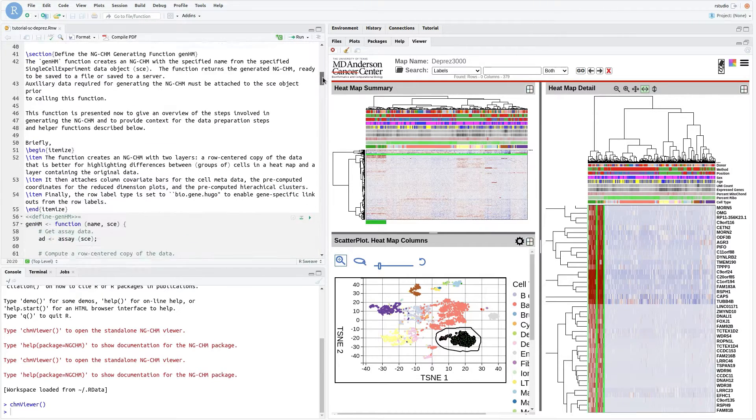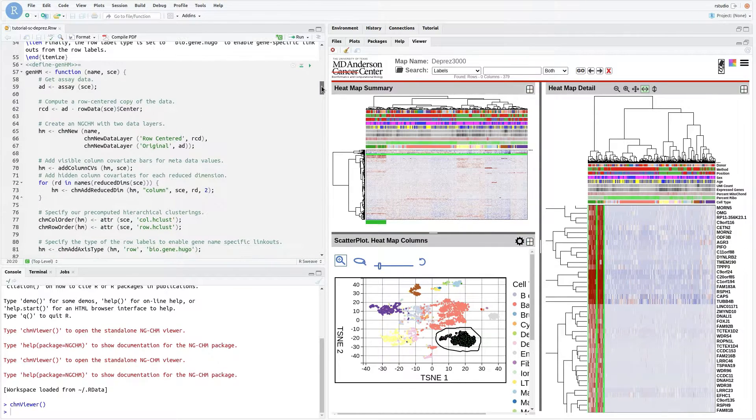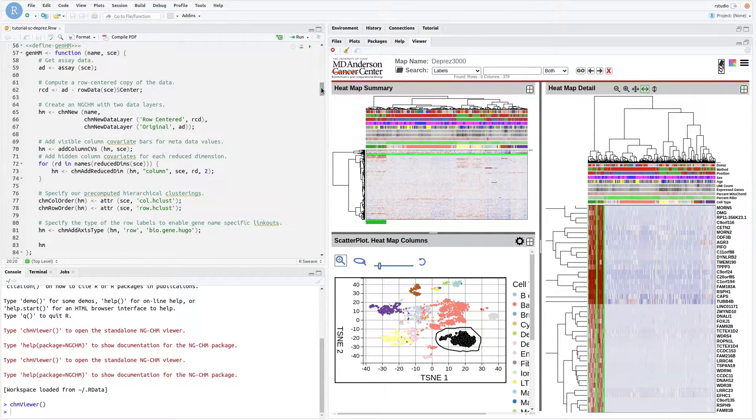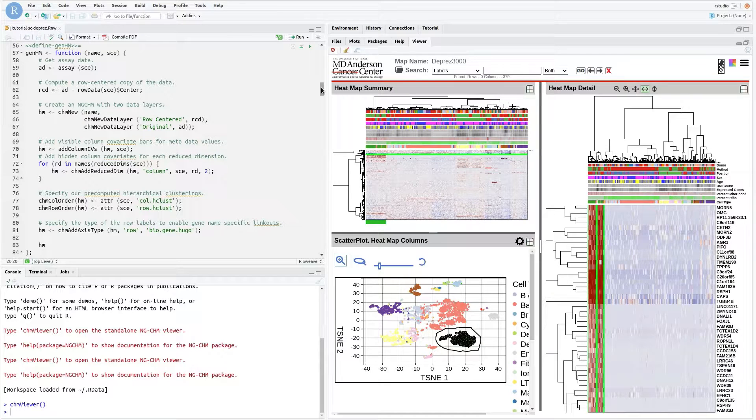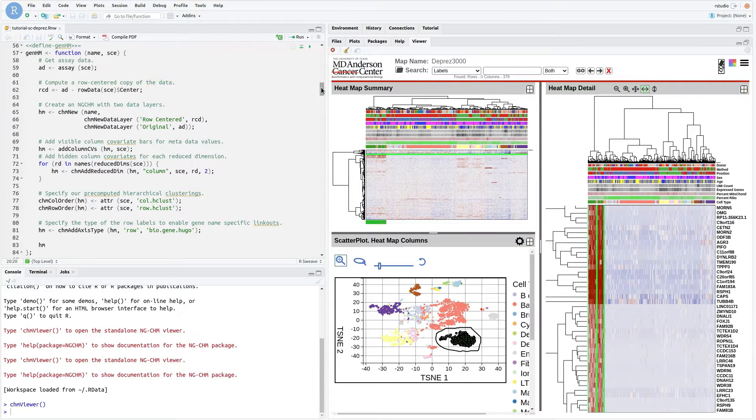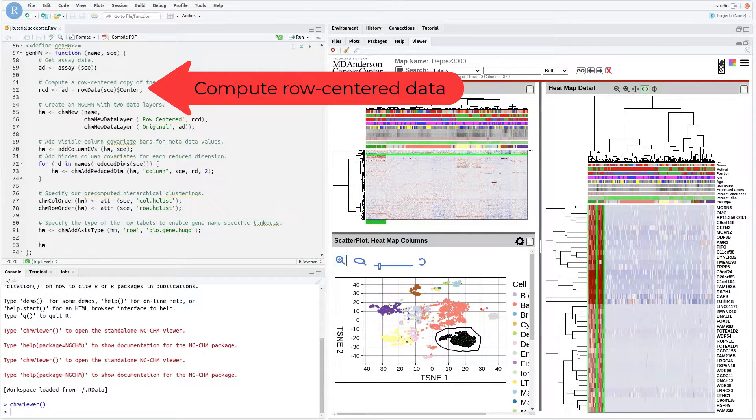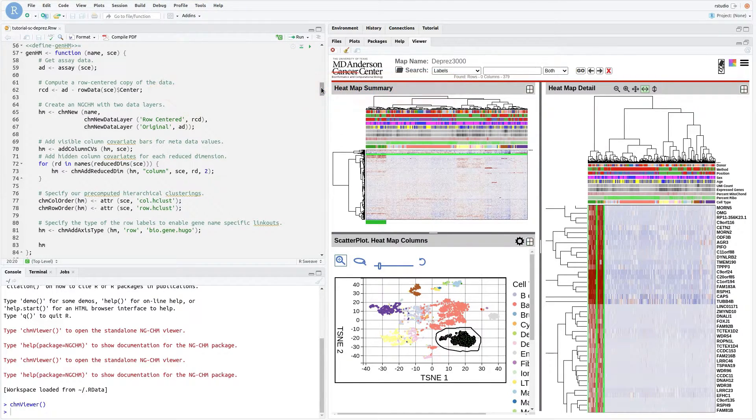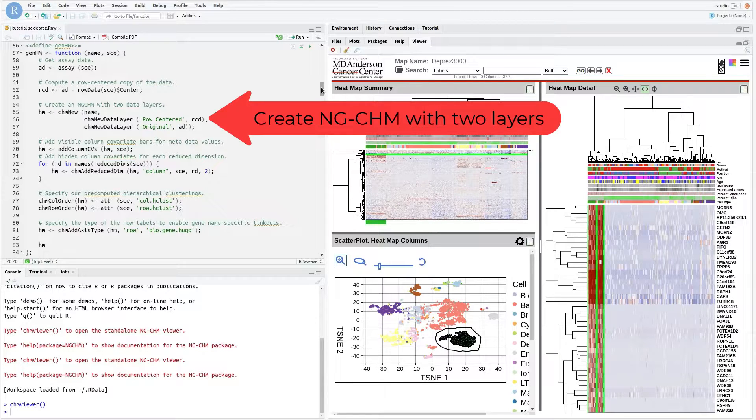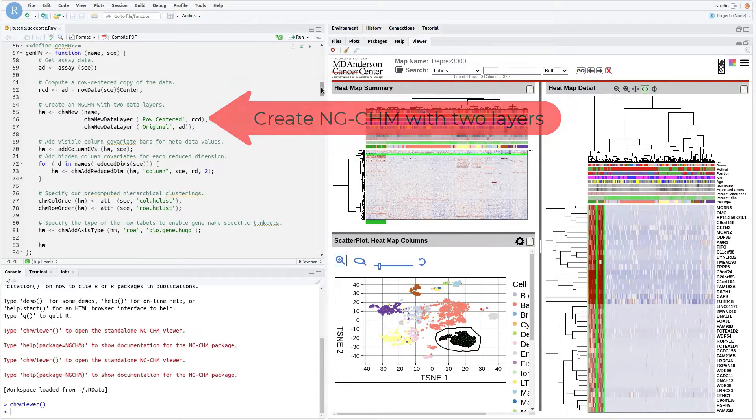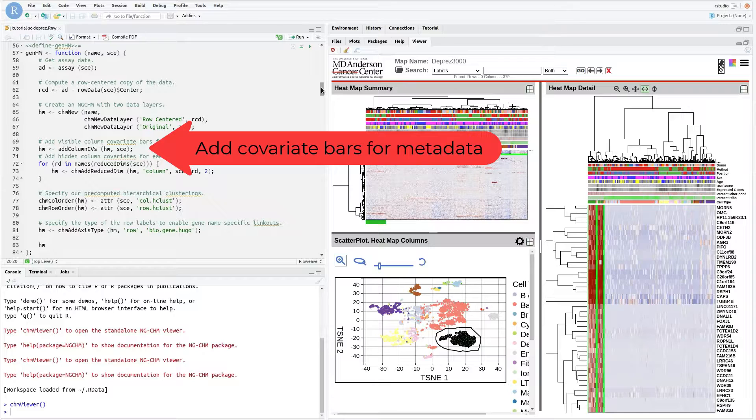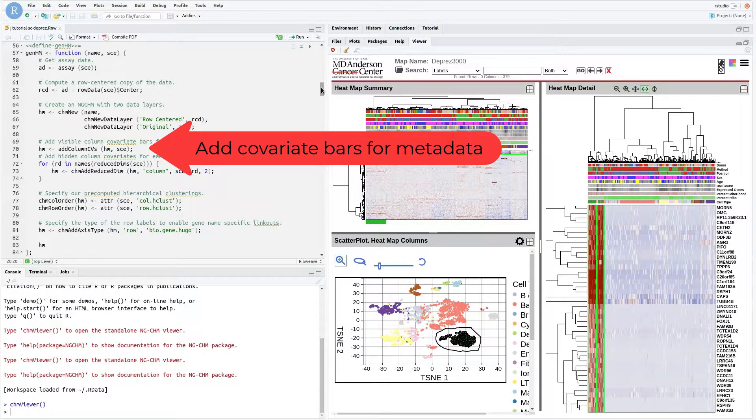We will start by reviewing the function GenHM, which generates an NGCHM from a prepared single-cell experiment object. The steps in the function are: get the desired assay data, compute a row-centered copy of the assay data, create an NGCHM with two data layers. Add the visible column covariate bars based on the metadata in the single-cell experiment object. The function Add column CVs will be defined later.